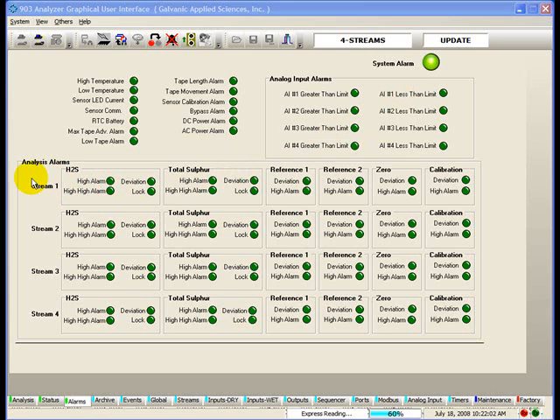High alarm is the first warning set point in a concentration range where the operator may need to be alerted of a situation in progress. High-high alarm is the second warning set point in the concentration range where the operator may need to take actions to alleviate this alarm. Many users will use the set point to shut in the process being monitored.